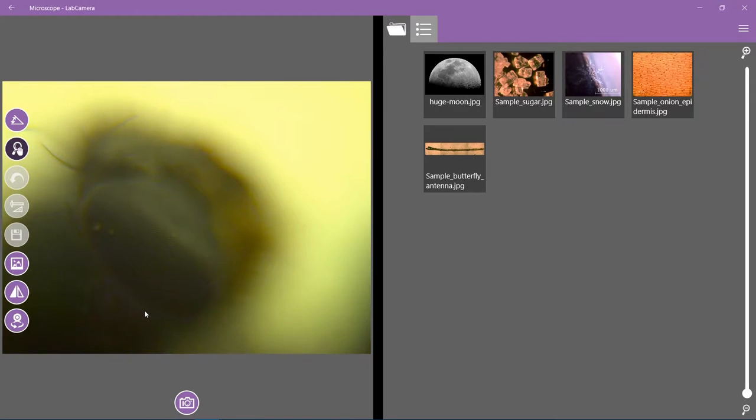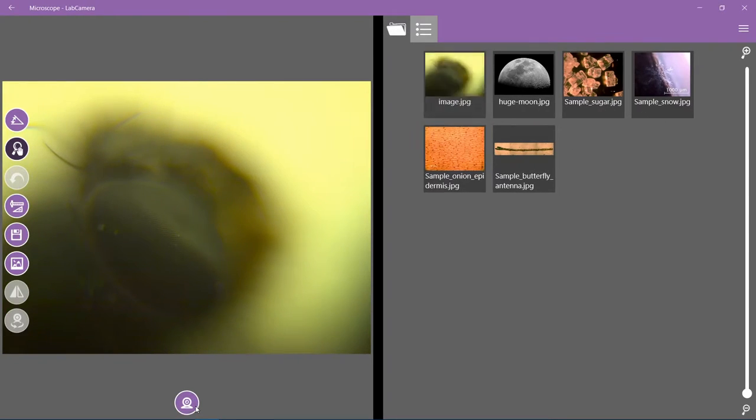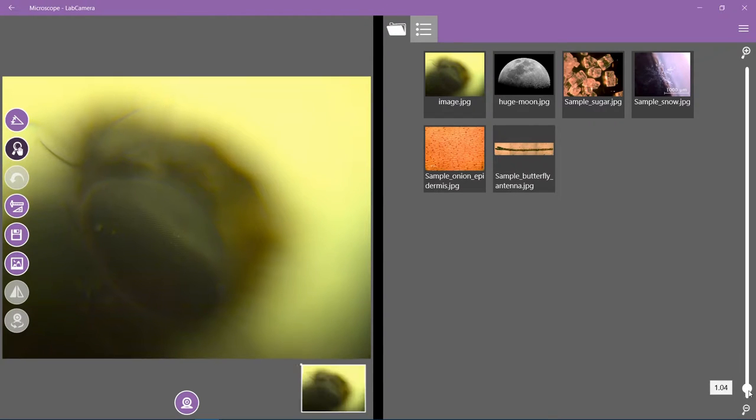Okay, now it's good. Quickly take a photo. Good. Okay, this one is good enough to see what I wanted. So this is the eye of the fly, and we can start making observations.